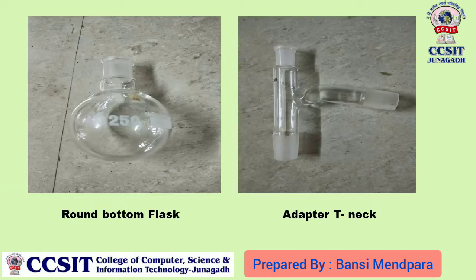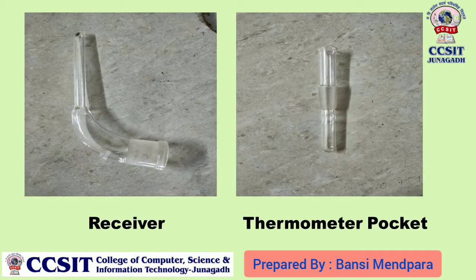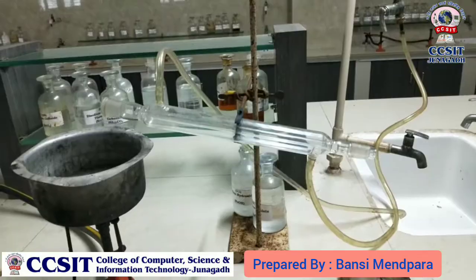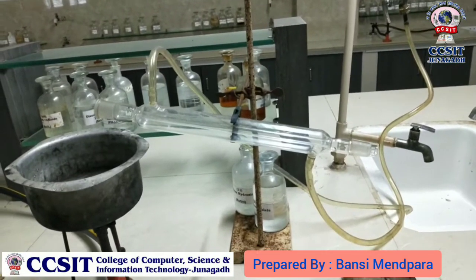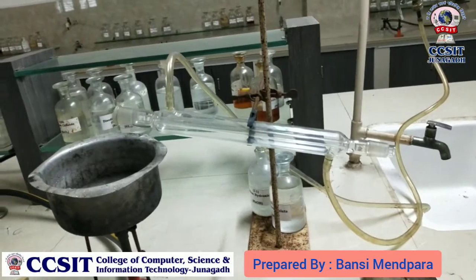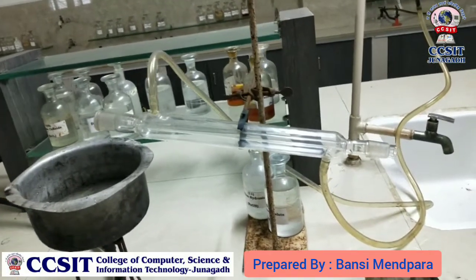There is a solid-liquid separation. There are many instruments used: round bottom flask, adapter, T-neck, receiver, and thermometer pocket. So let's start the solid-liquid separation.